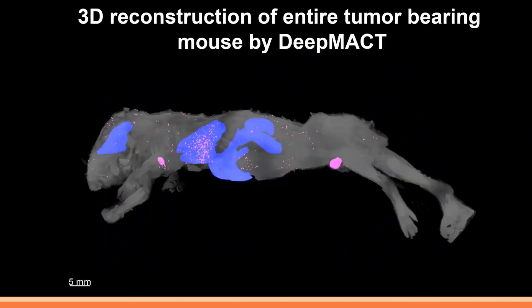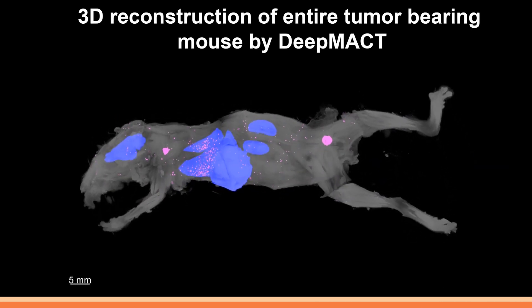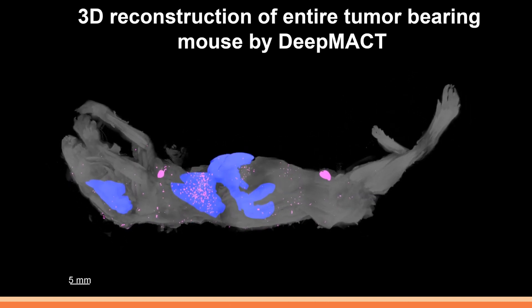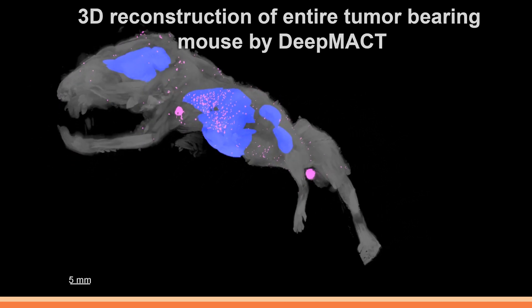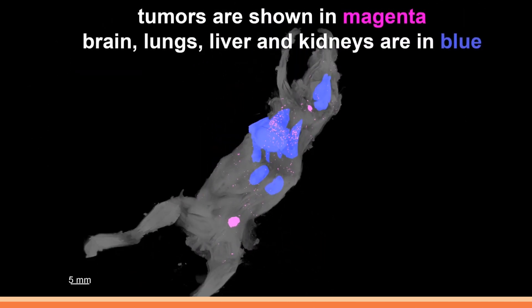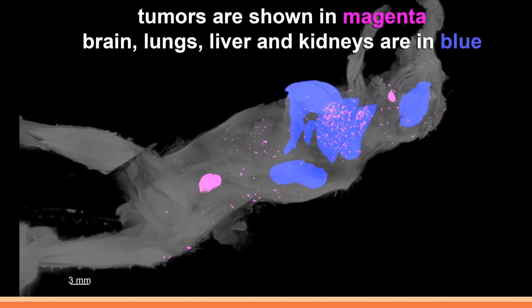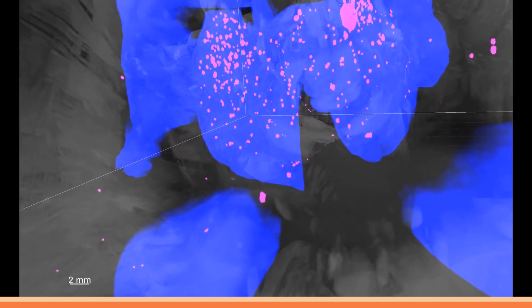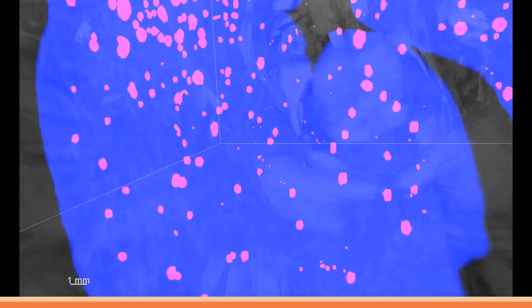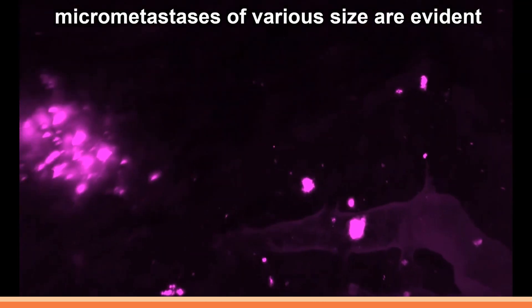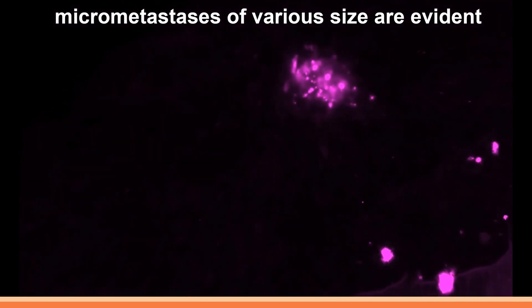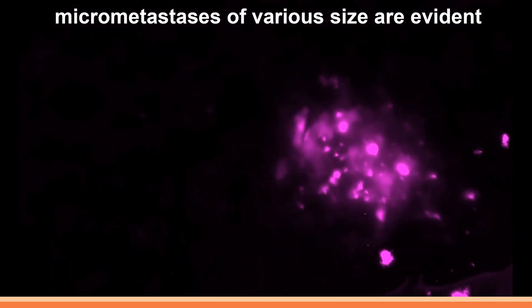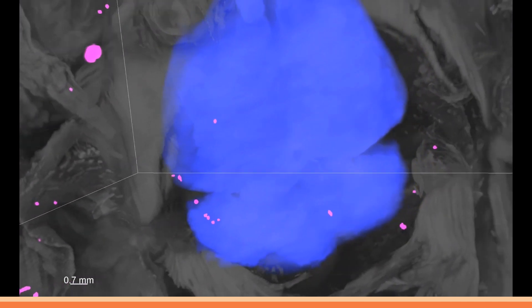A remarkable example from Dr. Ali's lab highlights the incredible capabilities of 3D imaging and the Ultra Microscope — visualizing cancer metastasis at the cellular level in a whole transparent mouse. The tumors are depicted in magenta and selected organs are marked in blue. His lab conducted this research using the Ultra Microscope and a deep learning burst method known as DeepMACT, which aided complete analysis of micrometastasis down to the level of individual cells, demonstrating the power of 3D imaging in uncovering complex details of cancer metastasis.